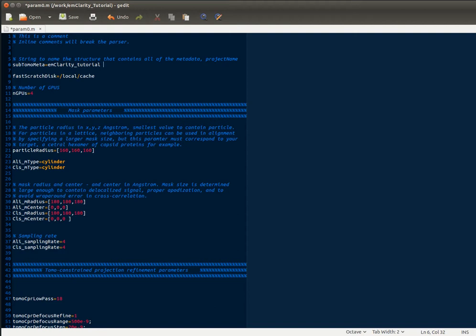All right, in this video we're going to work through and explain some of the parameters found in your parameter file, which is needed to run all the programs in EMClarity. The example is found in your docs folder and called masterparam.m. It's just a plain text file so you can name it whatever you wish.